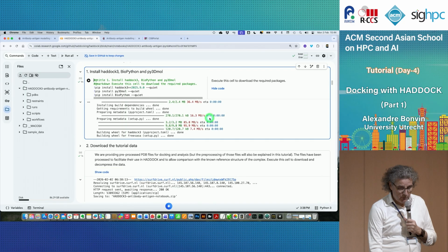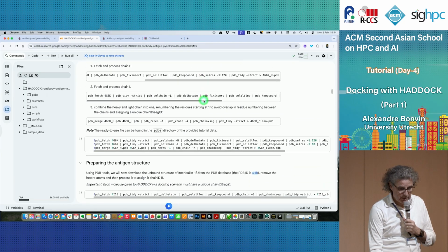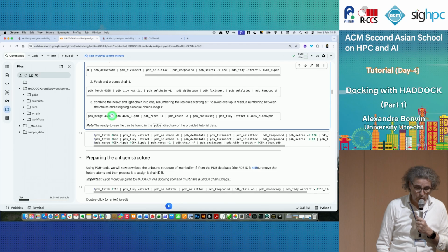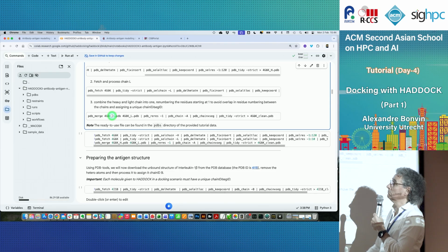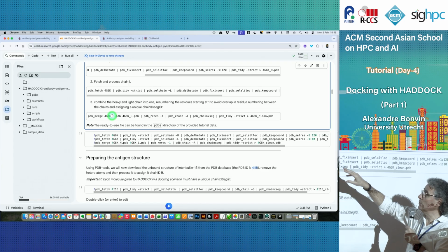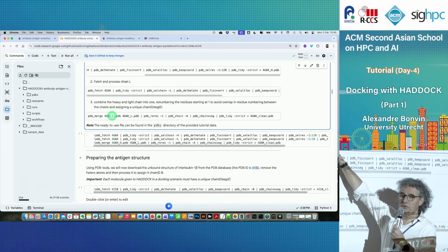And then we do the same for the second molecule. Now we are fetching chain L, okay? And then the third command will be merging those two chains, renumbering everything starting from 1 in this case. There are also ways in PDB tools where you can shift the numbering. But anyway, you want a unique numbering, and for this tutorial it's unique, and we rename it to chain A.